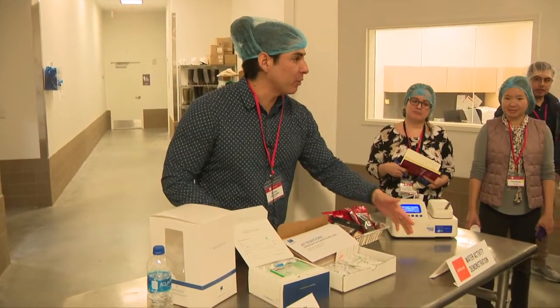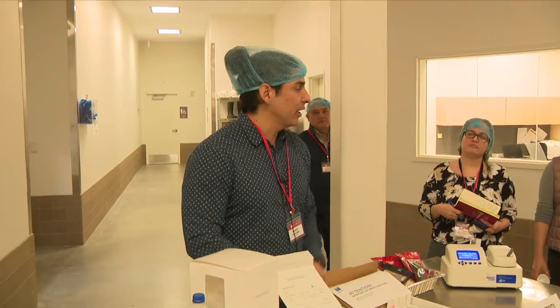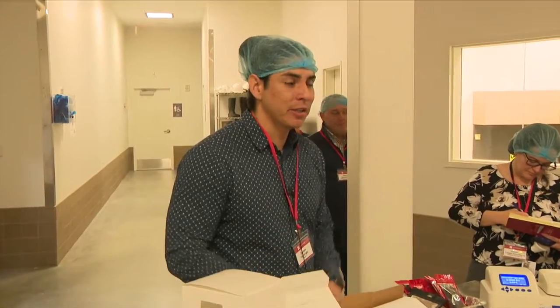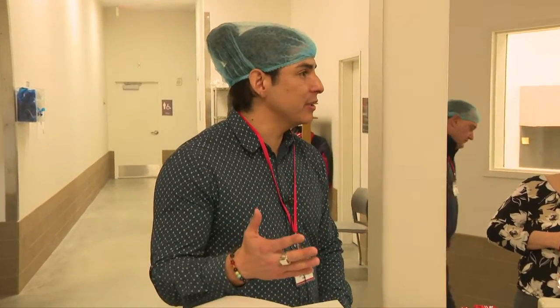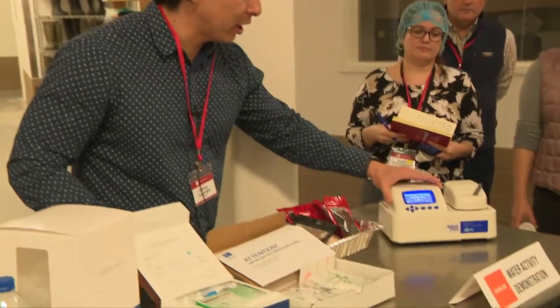My name is Zach. I'm with the company Aqualab, or the brand Aqualab. We make water activity devices and we've been doing this for about 40 years. I work as a food scientist but I also work with the sales team. Today I have a device here called the Aqualab 4TE.